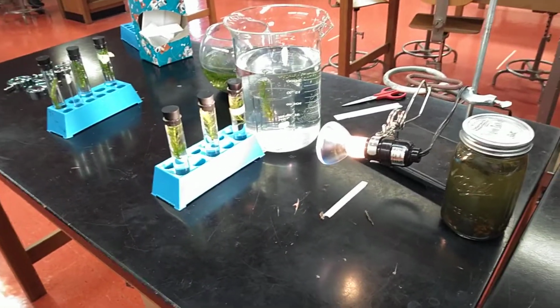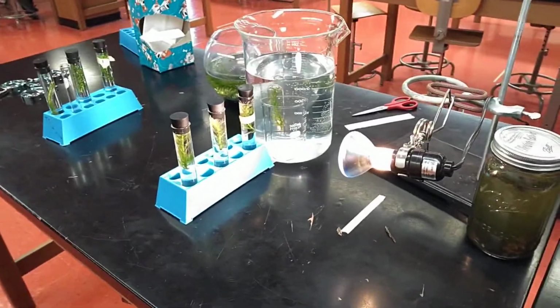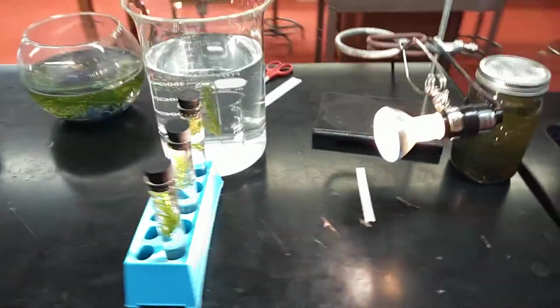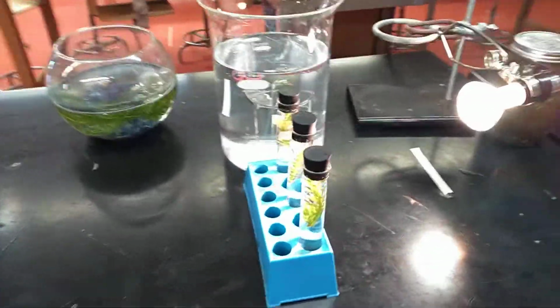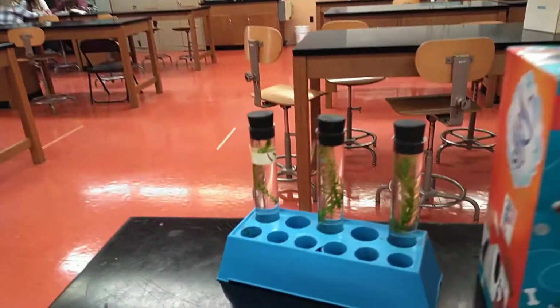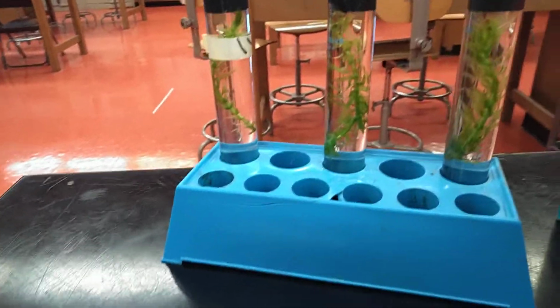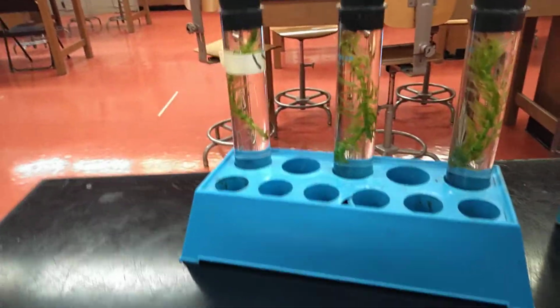I have a little demonstration I've been doing in class this week here. We're talking about cellular respiration and photosynthesis. Notice I have a light. I've got some test tubes with some plants inside. I also have some test tubes here, plants inside. They're farther away from the light. I also have a set of test tubes right here. These have been kept in the closet. They're not getting any sunlight, any light, except in the time they're out here.